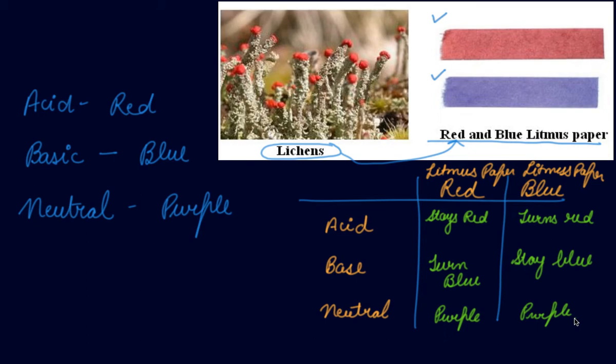Now take some lemon juice and dip a blue litmus paper into it. After about 5 to 10 seconds, you will see that the litmus paper has turned red. The blue litmus paper turning red shows that lemon juice contains acid, so it is an acidic substance.